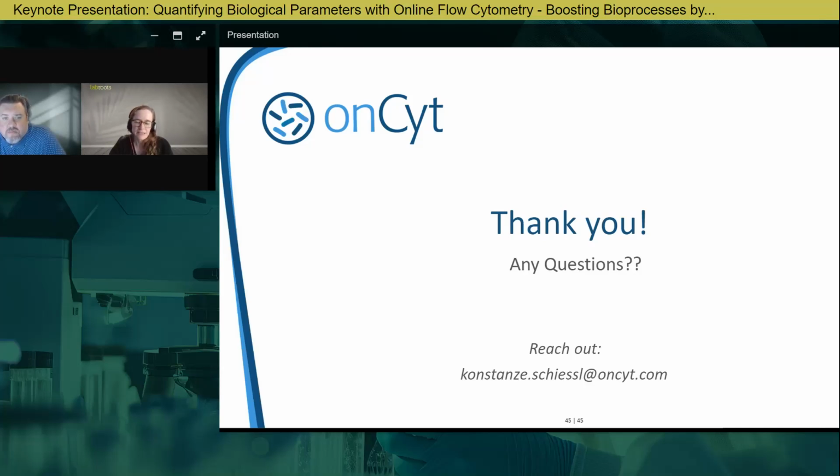The benefit that they have in some way is that you don't need a label. So it's really nice also to have label-free technologies. It makes everything less complicated when you don't need to use the chemistry. But I think they are maybe more limited in the range of really biological characteristics they can measure. So every method has its pros and cons. All right, thank you.